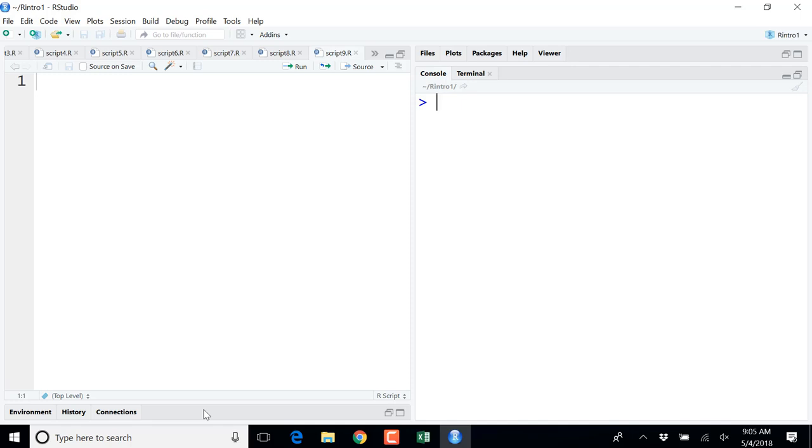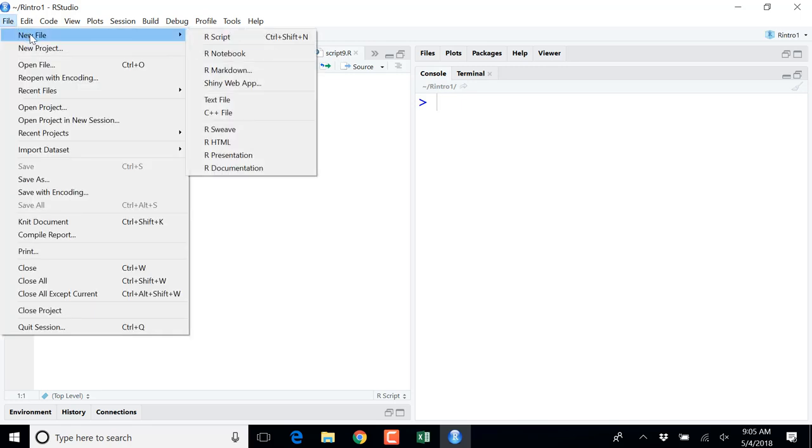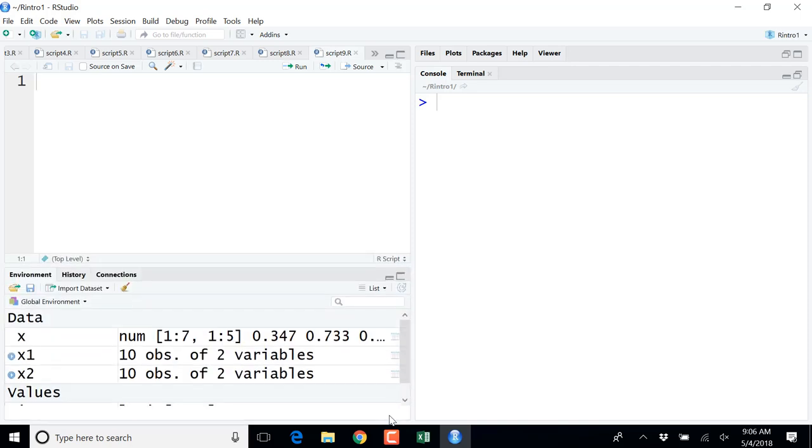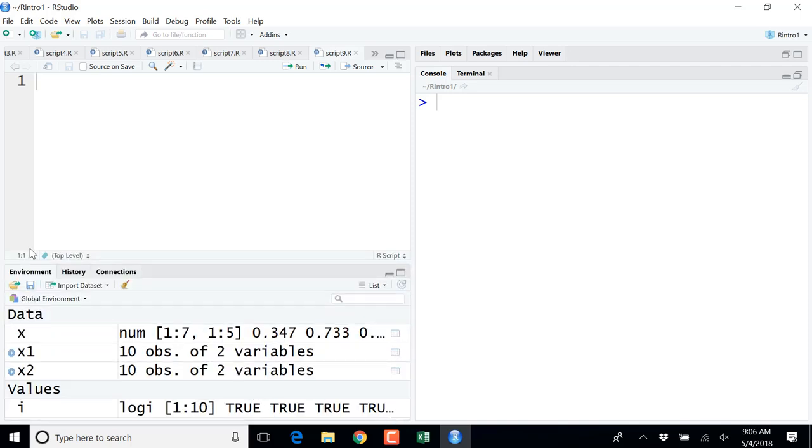Before we start, let's open R. I just make a new R script. Here, click Files, New File, and click R script. So I opened my new R script. And here in the environment, we have several data sets we played with, but I just want to clean up and start with something new, a blank.